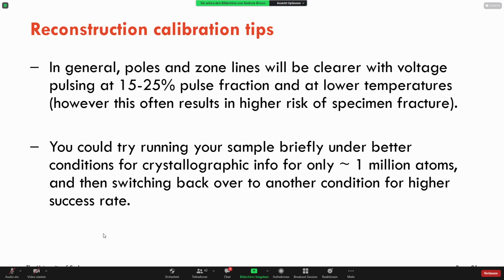And I think with the newer atom probes, not with the Invizo, but I think with the LEAP 6000, you can do some more sophisticated swapping between voltage and laser pulsing. So there may be some opportunity there to get the best of both worlds, so to speak.